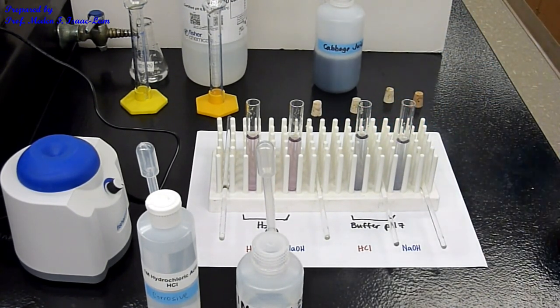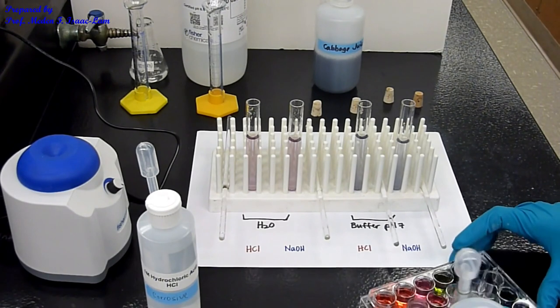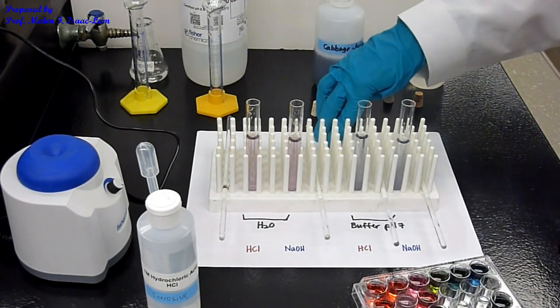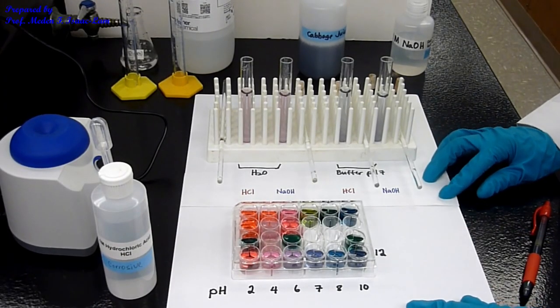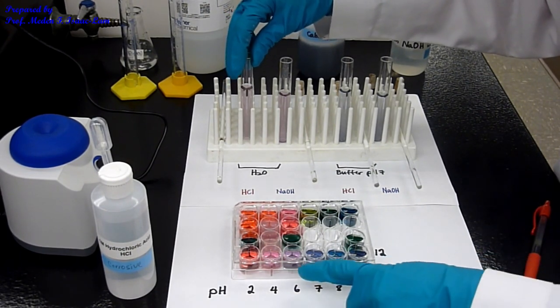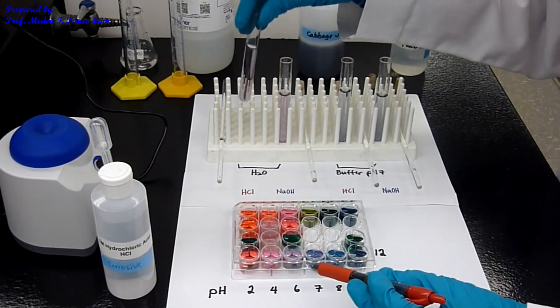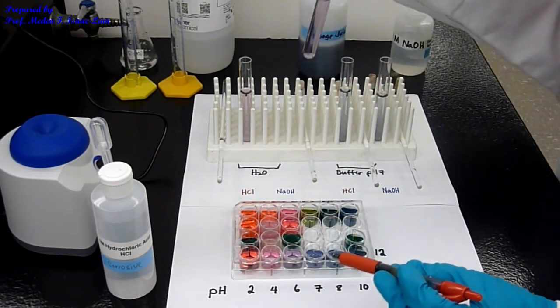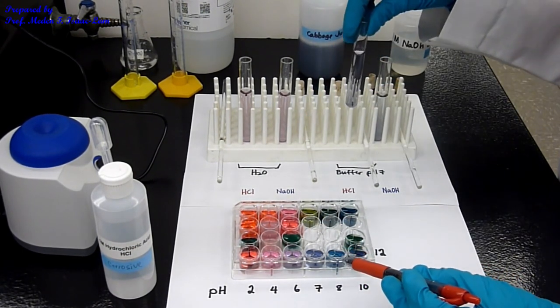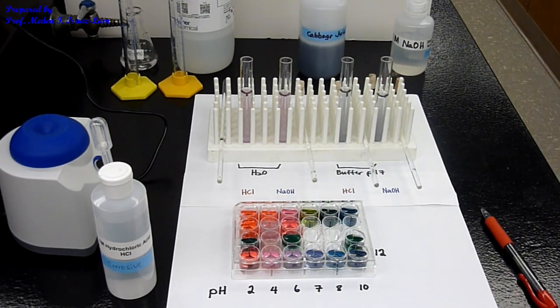Okay, so now we're gonna compare the color that we had before. So remember, this was our result. If you compare the color of this solution, the water, it's this color in here, so it's close to 6. The same thing as this one. For the buffer, it's 7. Buffer 7. Take note of the color.